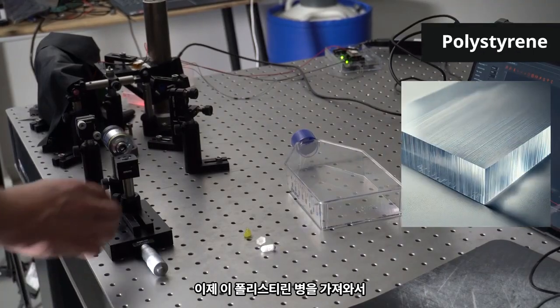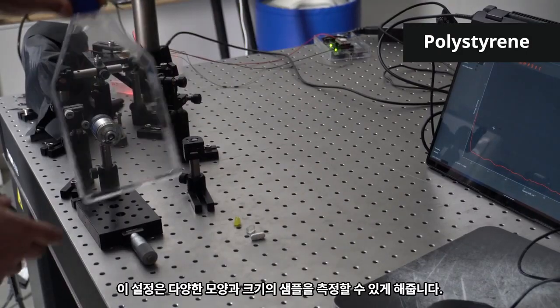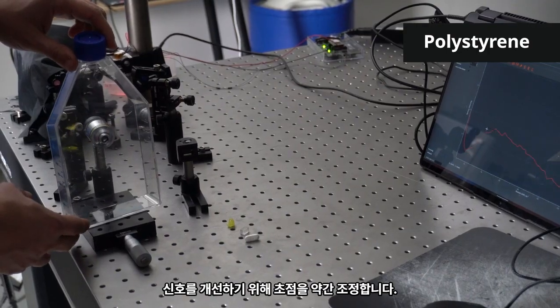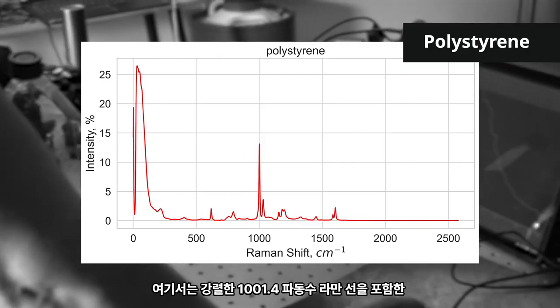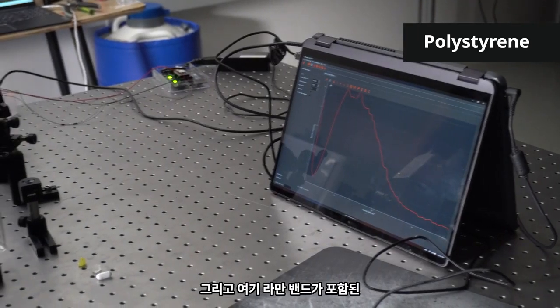Now let's take this polystyrene bottle and let's measure it. As you can see, the setup allows to measure the samples of different shapes and sizes. We slightly adjust the focus to improve the signal. Here you can see a typical polystyrene spectrum with an intense 1001.4 wave numbers Raman line.